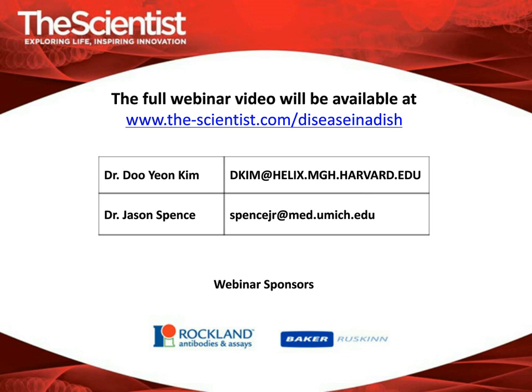Great, thank you. This question is for Dr. Spence. How physiologically relevant are the amounts of toxins you're adding to the organoids? Is 400 nanograms per milliliter what a cell would see in vivo?